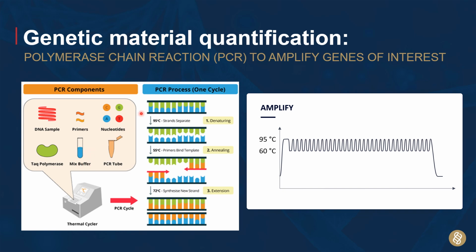correctly. And if we look at the process, it follows the very same process of denaturation at 95 degrees Celsius, annealing of the primers and probes depending on their design, but typically at between 55 to 60 degrees Celsius, and then extension of those primers to form a new double-stranded DNA molecule. And this process repeats a number of times, depending on the design of the assay, but between 35 to 40 cycles typically. And at the end, we've got an amplified DNA product.